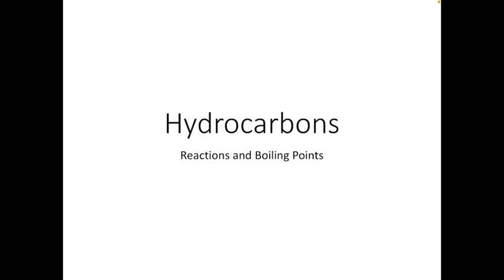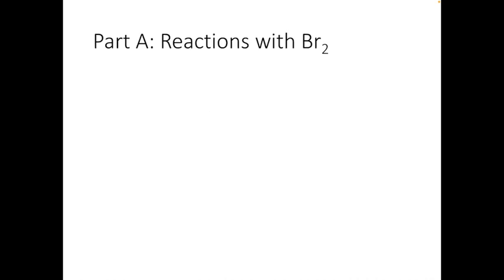Hi everyone. In this video, we're going to go over the hydrocarbons lab, specifically the different reactions and the boiling point experiment. Now, the main purpose of this lab is to determine the identity of an unknown compound. So we're going to run a few tests. At first, we're going to run these tests on known compounds to figure out what our unknown compound is, and we can compare our unknown compound with the known compounds.